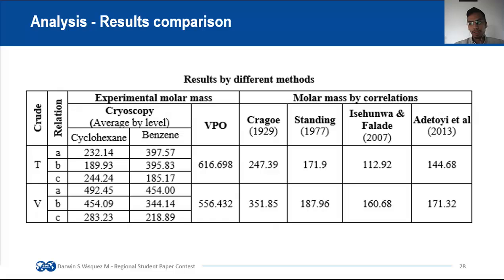However, it is possible to use a solvent concentration in which the solution has a little deviation from the ideal model. Here, the experimental results do not allow studying in high detail the deviation that the solution had with respect to the ideal model. Also, the reliability should increase in terms of concordance, reproducibility, and the real average molar mass of the oils.